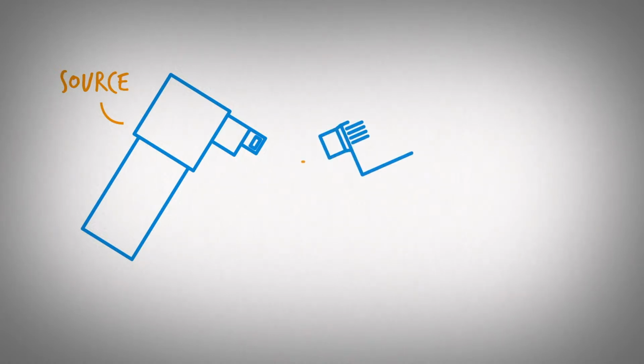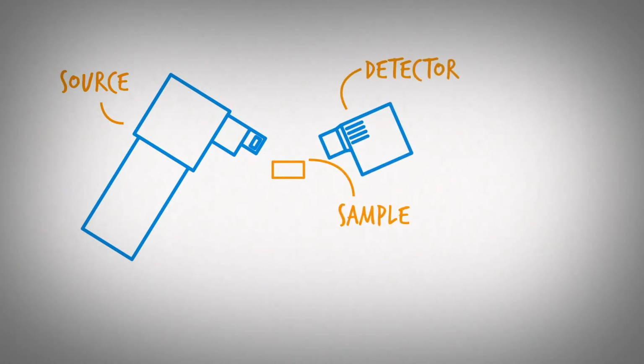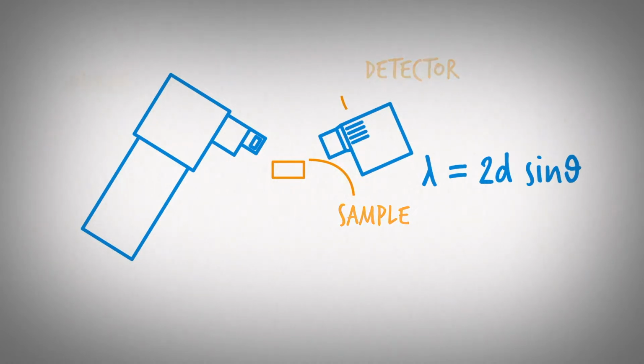In order to measure the texture of a material, X-ray diffraction is used. X-ray diffraction is a technique sensitive to the atomic distances in a material. In a texture experiment, the instrument is locked onto a single atomic spacing. Then the sample is rotated and tilted with the intensity of the emitted signal proportional to the number of crystallites oriented in each direction. Tilts can be accomplished by tilting the sample to the side, called side-inclination, or by offsetting the incident and diffracted beam, called iso-inclination.